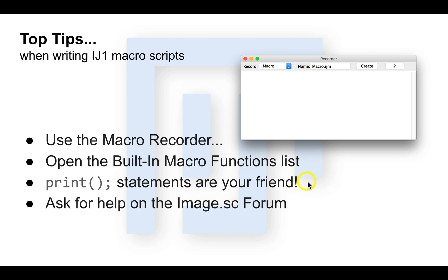Next, print statements. Print statements are also your friends. If you need to check what files or file paths you are currently running, add a print statement. If you need to check the values of something in a for loop, add a print statement. Print statements are there to help.